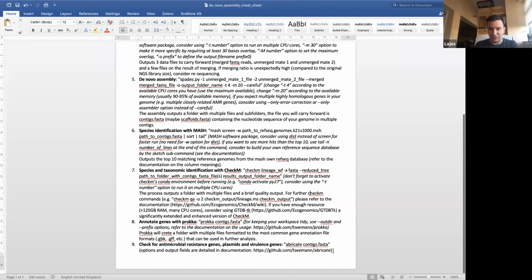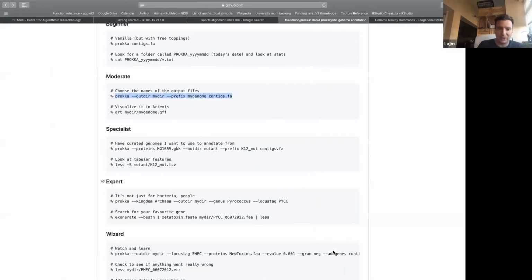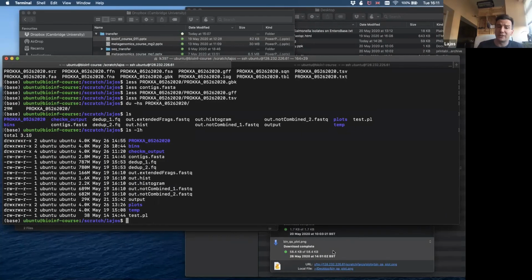I haven't done this, so let me just remind myself that the cleanup has to be here, and I will write what the cleanup steps are. So what are those files that, after you have a successful assembly, you can easily delete and free up the space.